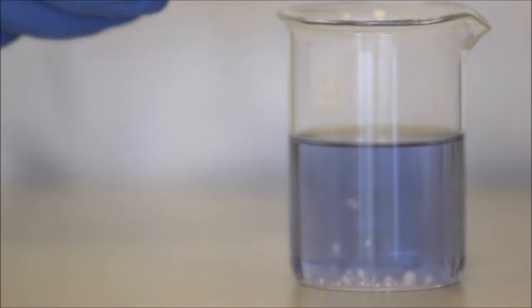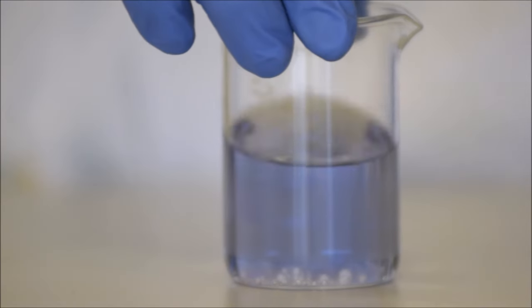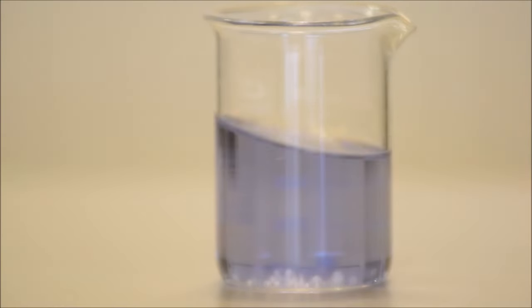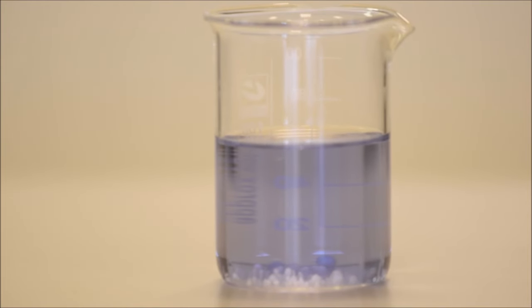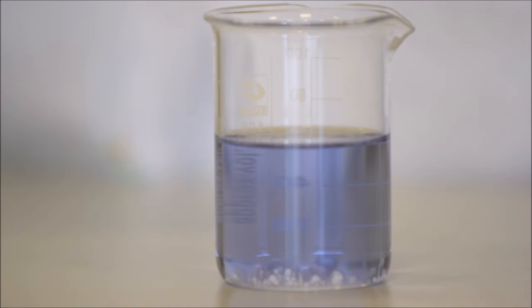add a few lumps into the bottom. It doesn't have to be an exact amount, but you'll start to get the idea of how much is needed, because if there's not enough, it'll look all watery on the bottom, and if there's too much, well, you're just wasting the material, and it'll probably hold on to some of your product that you're hoping to get back out of your organic layer. Once you've put it in and given it a little bit of a swirl, wait a few minutes. Again, it's about patience, 2 or 3 minutes, and it'll work just fine.